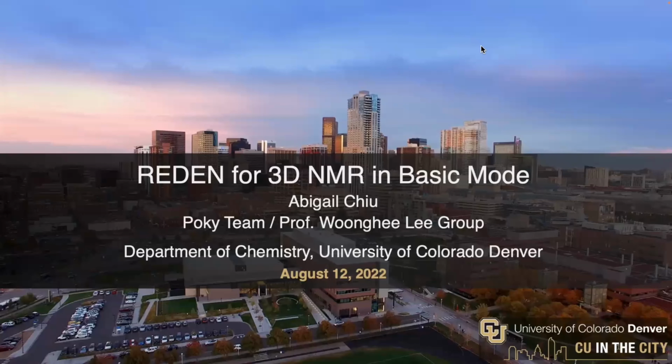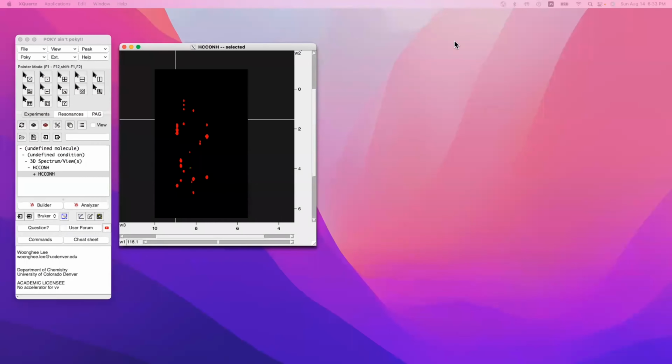I'm currently in Dr. Woong Hee Lee's group, and in this video, I will be giving a tutorial on how to use REDEN for 3D NMR in basic mode. I have opened my HCCONH spectrum in POKY. I'm gonna zoom in on this peak right here, because that's the peak I want to analyze.